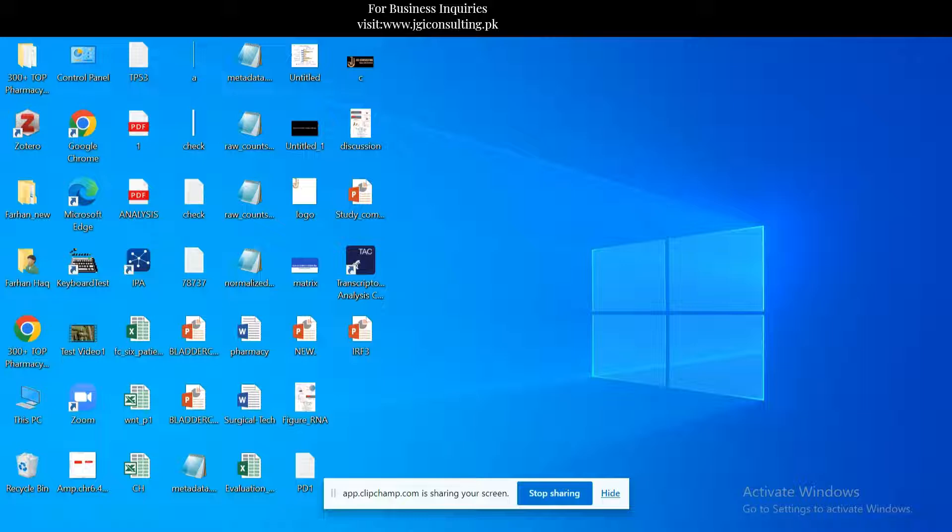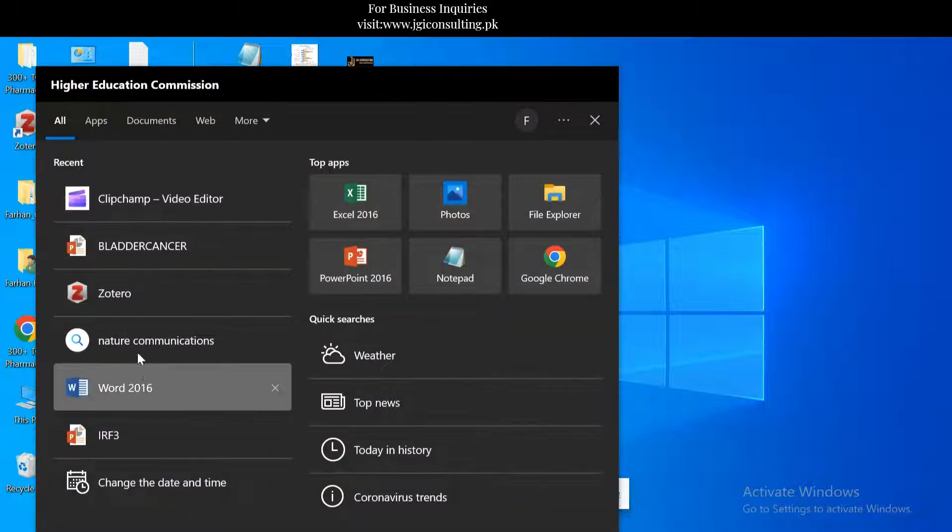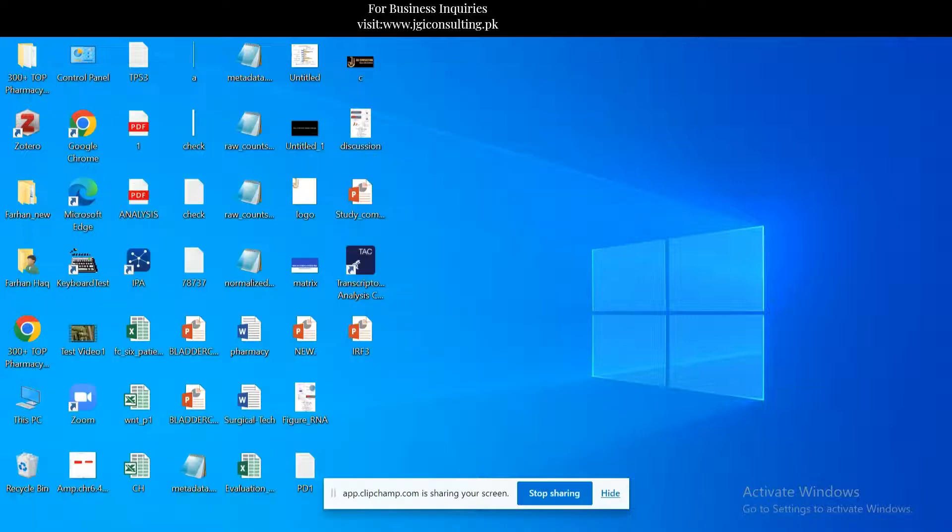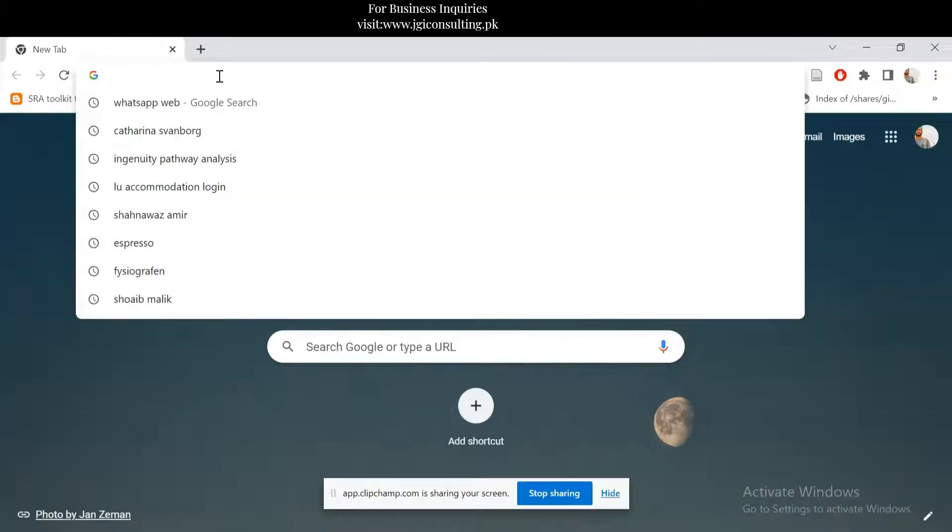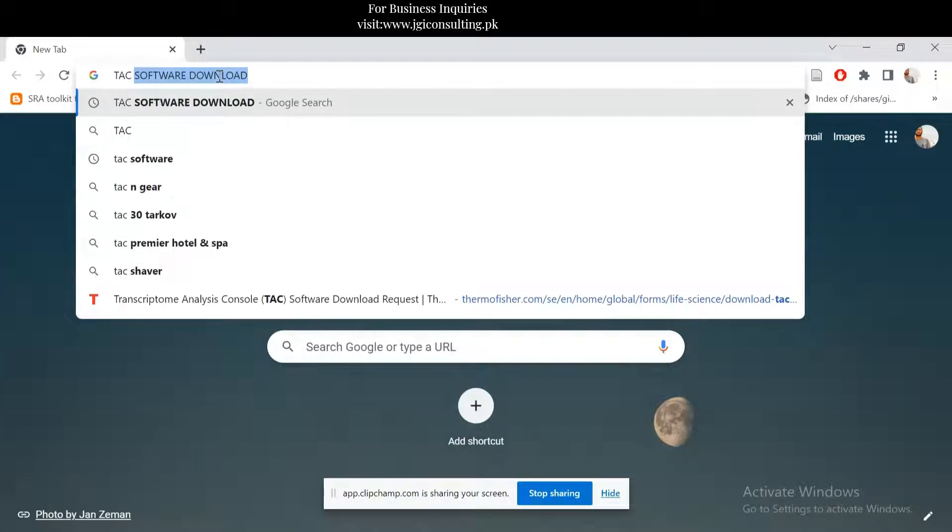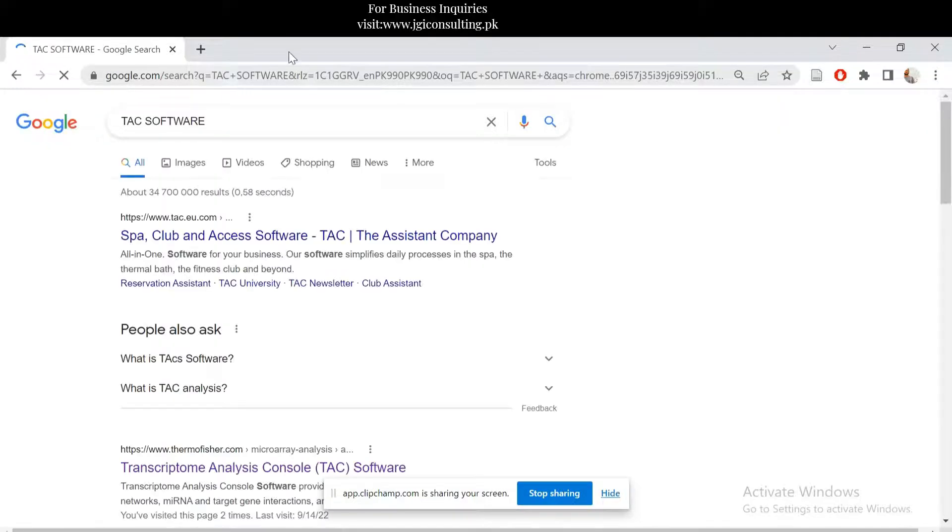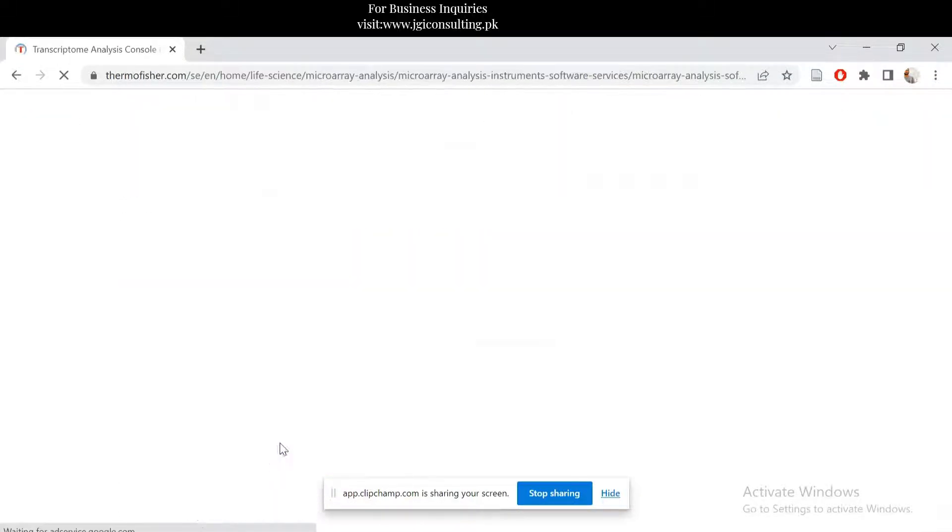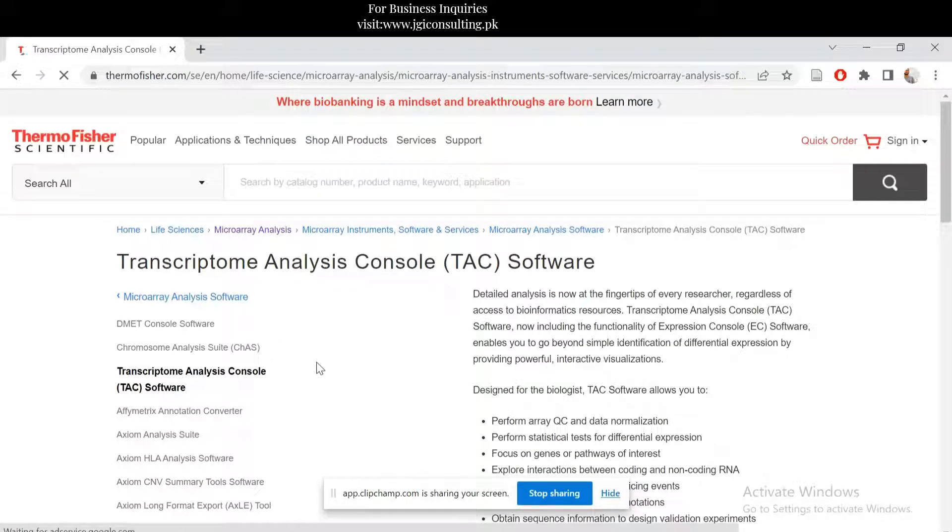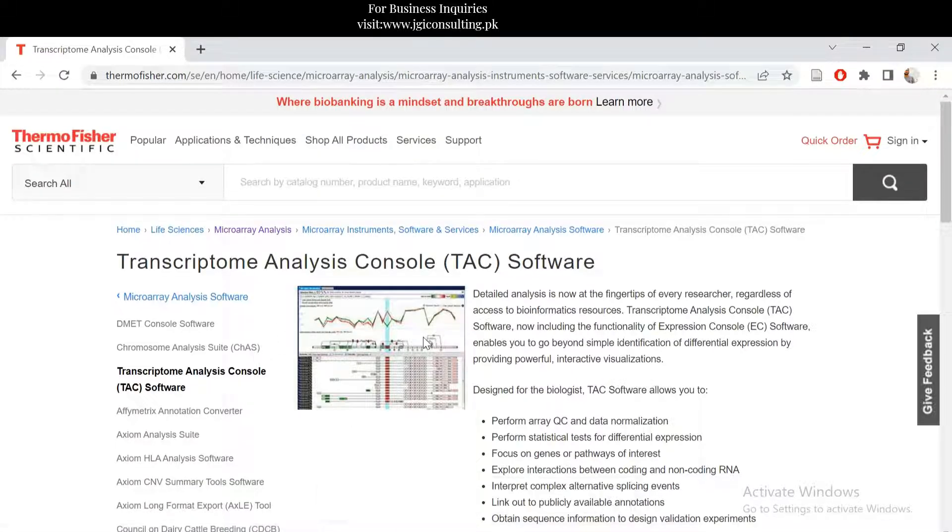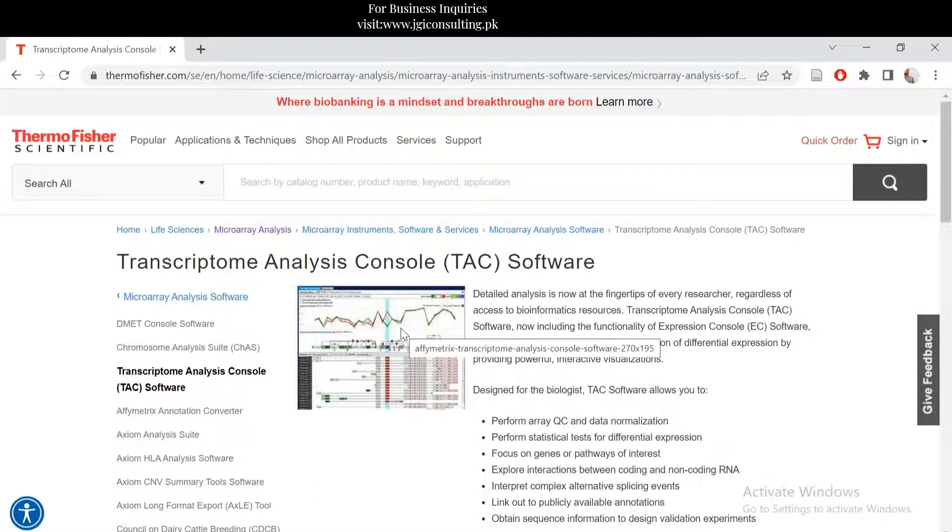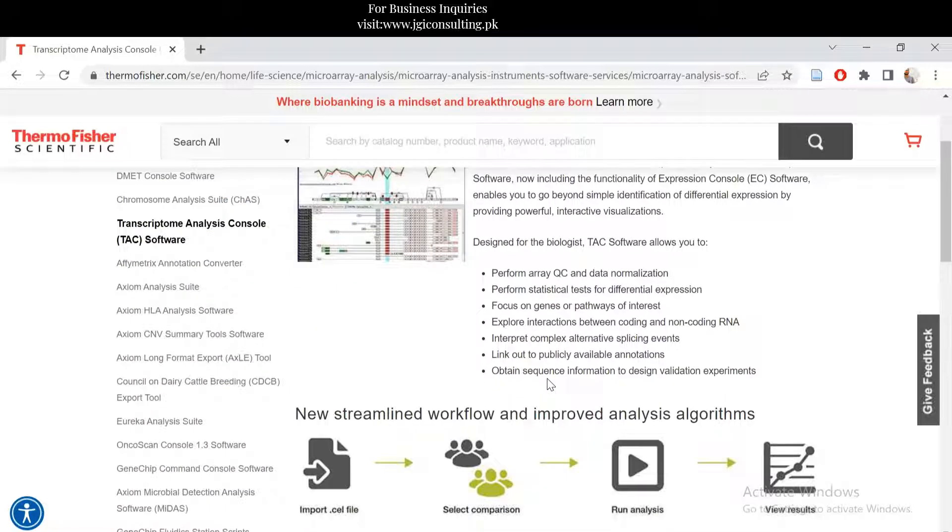The name of the software is TAC. For example, if you go and you can check here this Transcriptome Analysis Software. This software is actually a software where you can do the microarray analysis and perform different statistical tests.